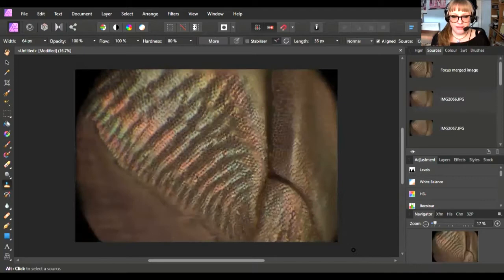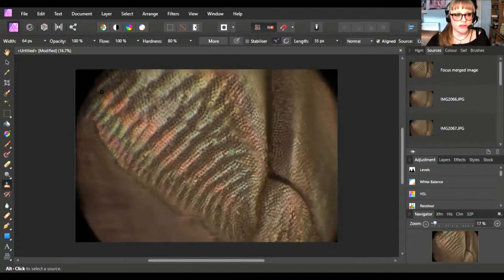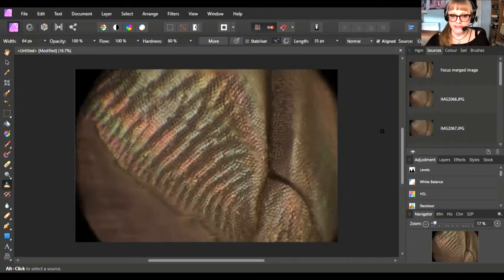There you go. That's a raw image that's been stacked. Then you just go up to file and export, and then you can save that image wherever you want to save it. I generally just save it as a JPEG because they were shot in JPEG initially. So that is all that there is to actually doing the focus stacking.